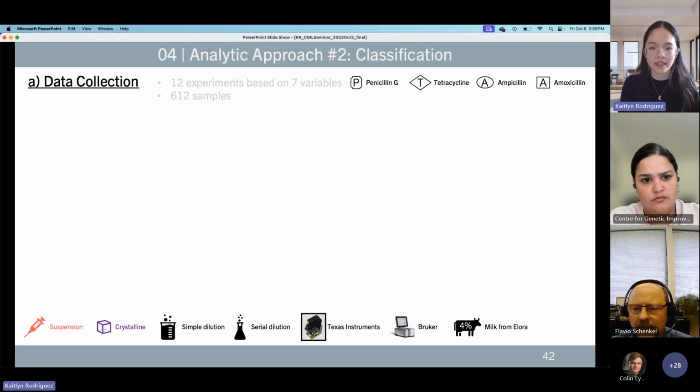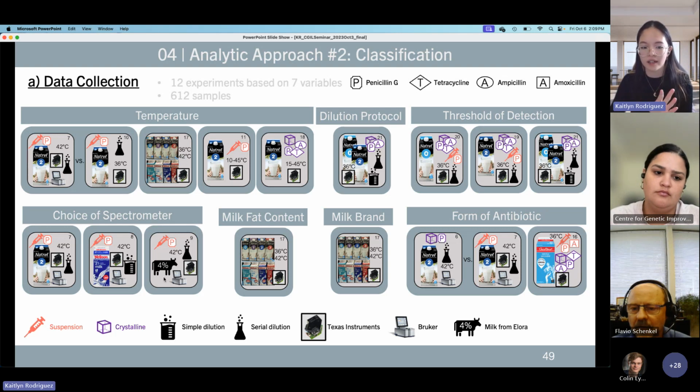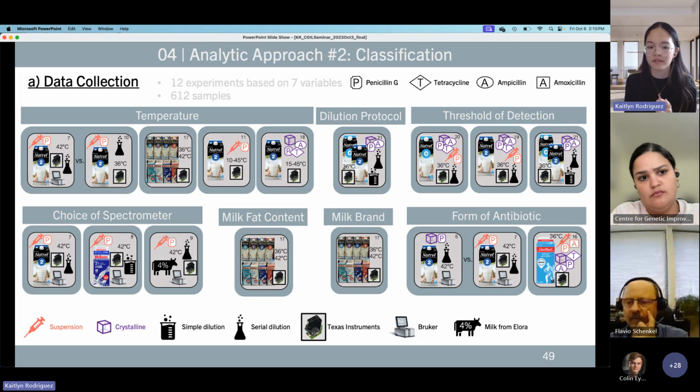In this data set here, I showed it very quickly. In some of these experiments, we have 2% milk. Here, it's very small, but we have 0, 1, 2%, 3.25. And then, as you mentioned, we have that milk from Alora. I couldn't squeeze it into this presentation, but in a specific chapter of my thesis, we're interested in whether temperature affects our analysis, and whether milk fat content affects our analysis. So we have samples of different types of milk fat. And then in future analyses, we want to add that data in as its own input column and see if this milk fat percentage has an impact.